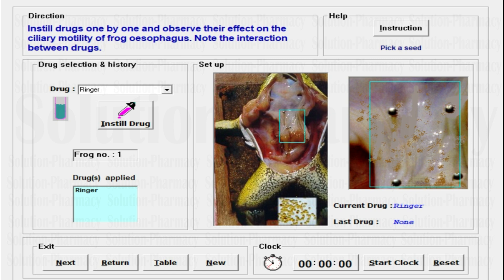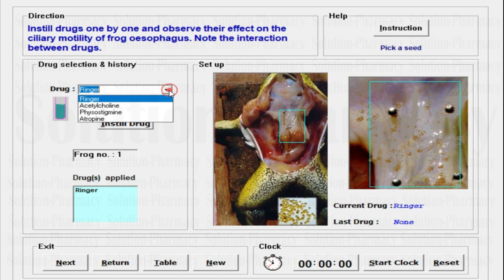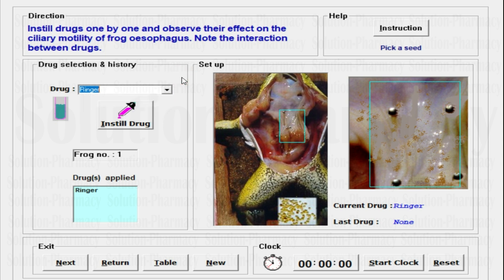First of all, we have to study the directions which will be observed by the student while experimenting on the Xform software. The direction says: instill drugs one by one and observe their effect on the ciliary motility of frog esophagus, and note the interaction between drugs. You have to keep an observation copy to note the readings. You have to select a drug, instill it on the esophagus of the frog, then observe the effect. We have a few drugs available: Ringer, acetylcholine, physostigmine, and atropine.